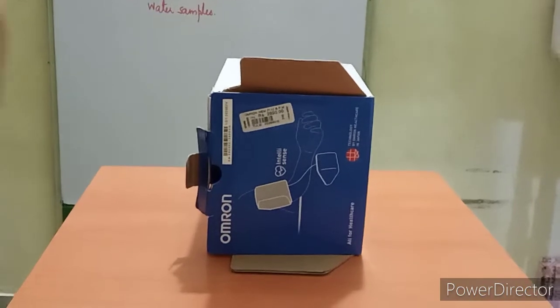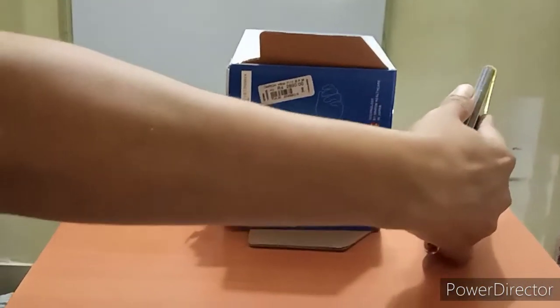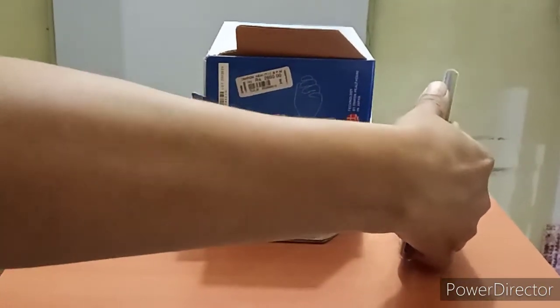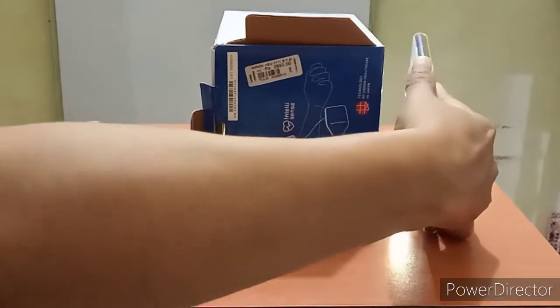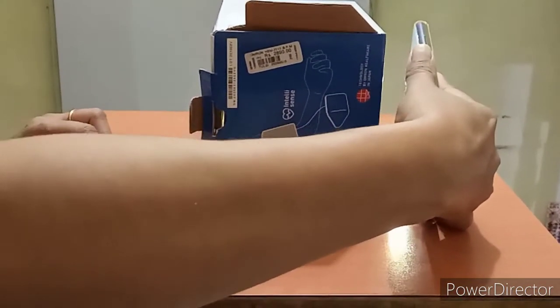We are going to place the torch on the other side and check for the suspended particulate matter, and we have to put our eyes on the other side of it. Here we can see some particles are suspended in it. This is the suspended particulate matter. So this shows that the water is not clear and this water is not potable.